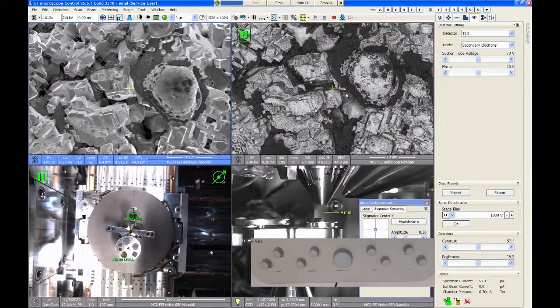It also scales with density as well, but usually people have fully dense stuff, so that's harder to see. But if you have a sample like an iron chrome mixture, backscatter is probably not going to help much, because the two elements are so similar in atomic number that you're not going to see much. But EDS is much more sensitive to that. EDS will tell you the difference between iron and chrome easily. Does that make sense?